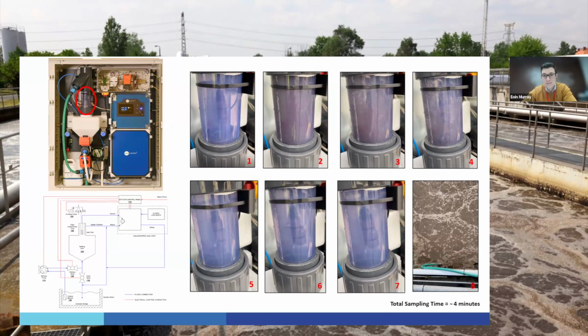So you can see the aeration tank sample is filled into the external tube. You can see it's settling in photograph 3. In photograph 4, it's beginning to settle. Then at photograph 5, you can see that the external tube now is full of supernatant. The solids have been removed.